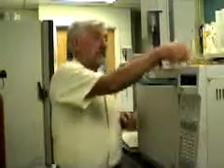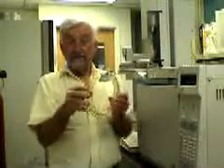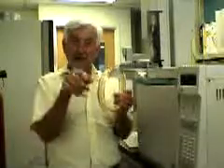Now in this machine, there are two columns rather like this. It's a very thin tubing wrapped around many, many times. And this tubing is set up so that each individual PCB congener will take a different amount of time to pass through this whole series of tubes. These are multiple winds around here, so it's a very long distance.